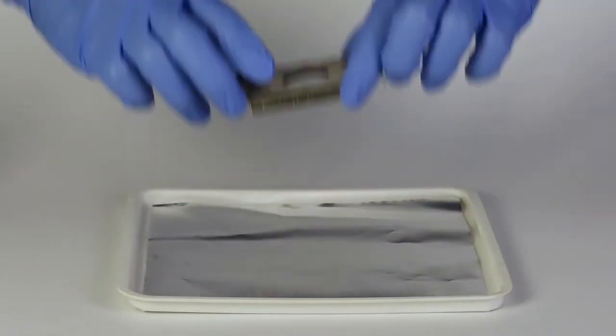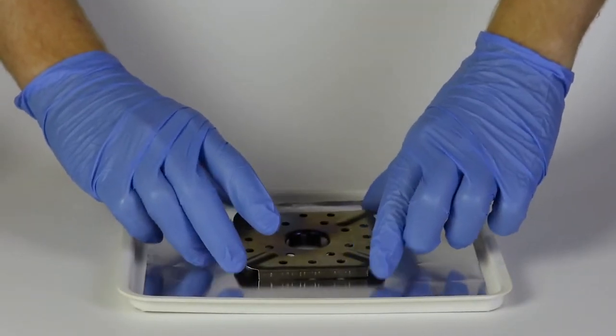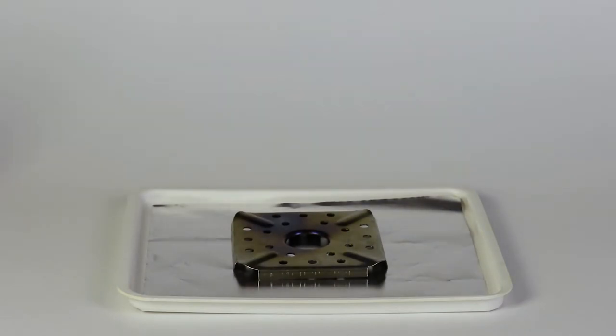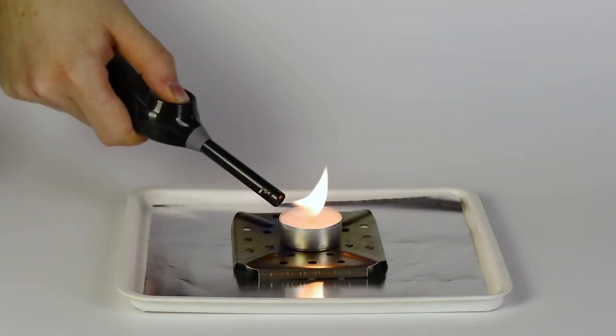Put the foil on the plastic tray and hold it down with the flame diffuser. Then put the candle on the flame diffuser. Light the candle.